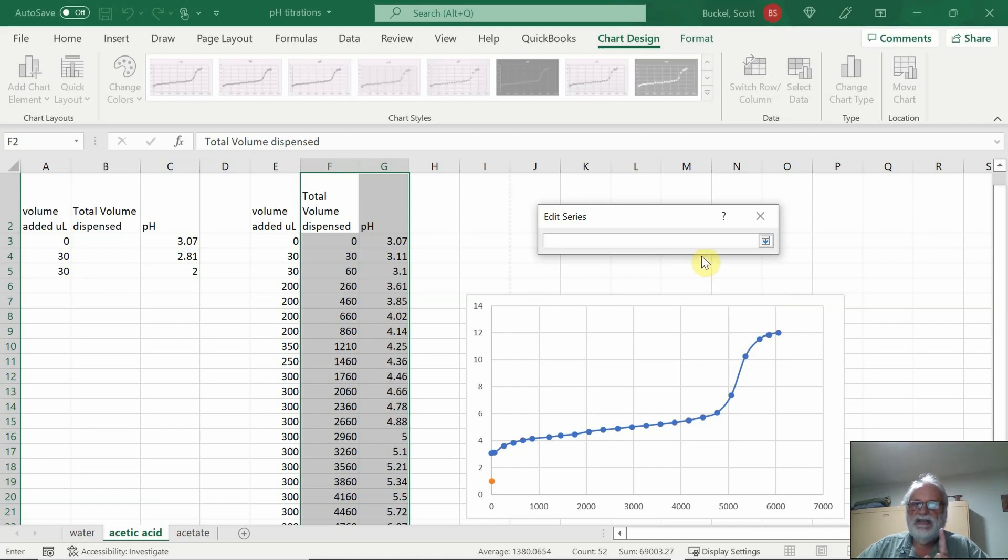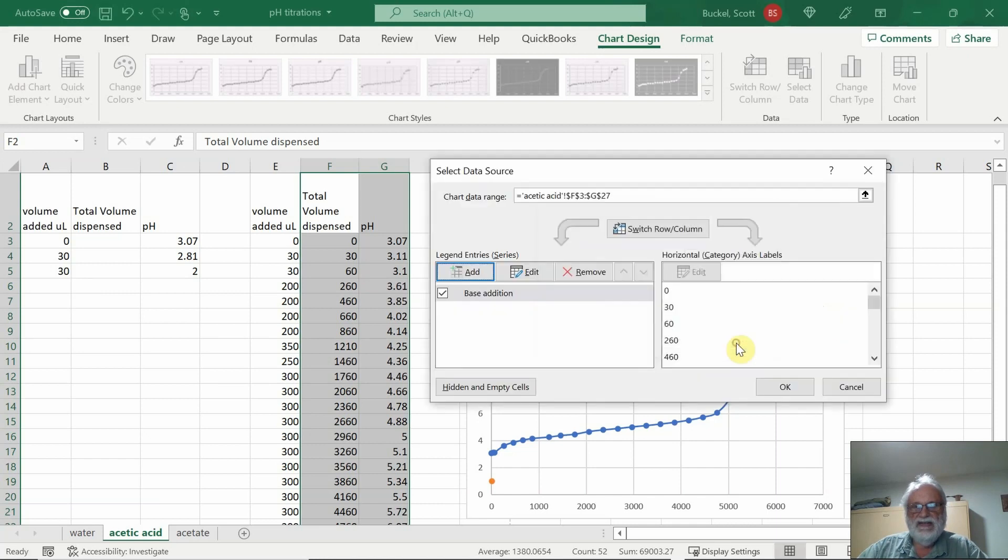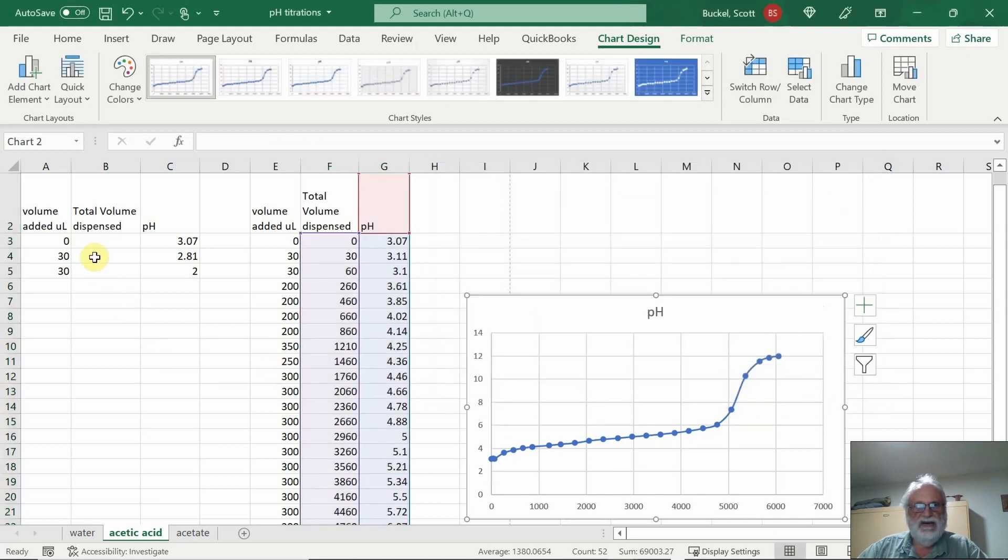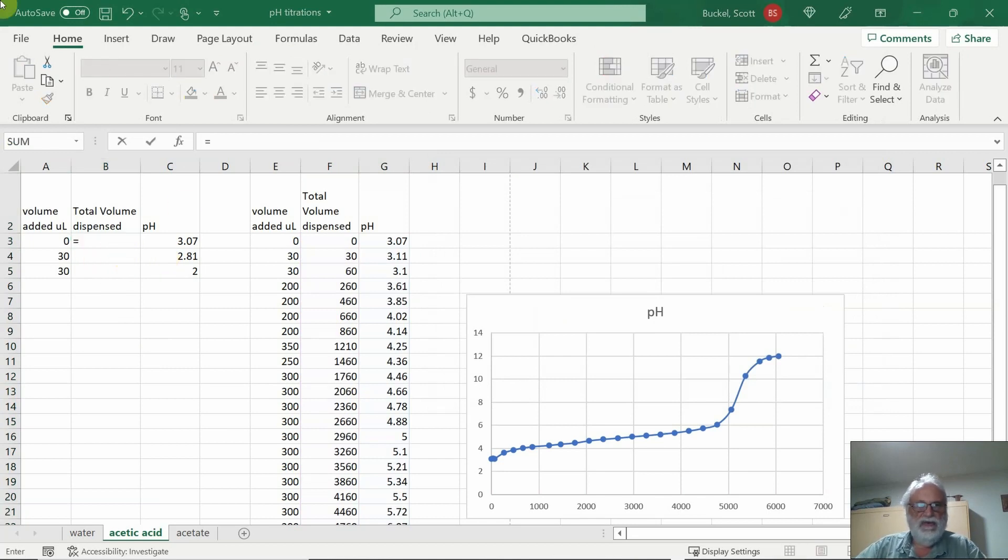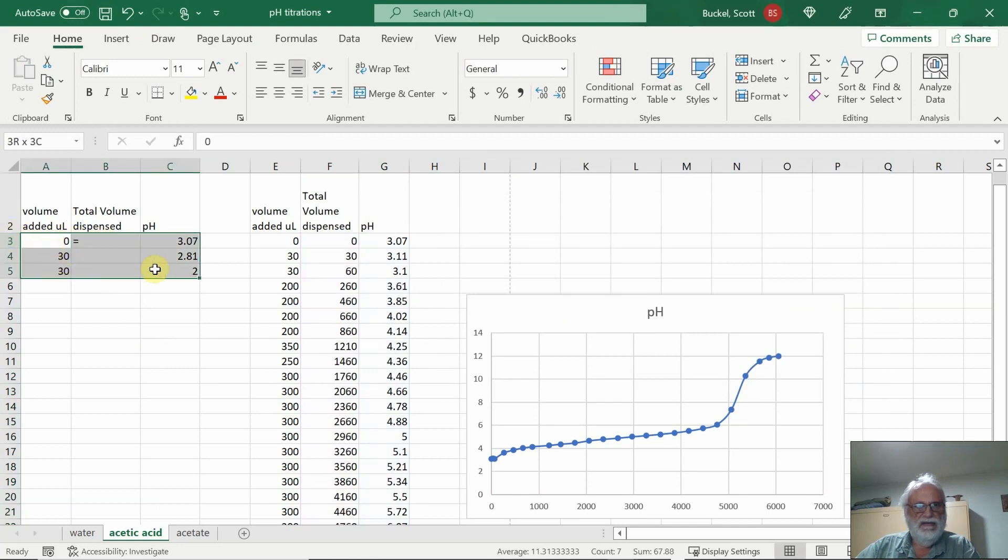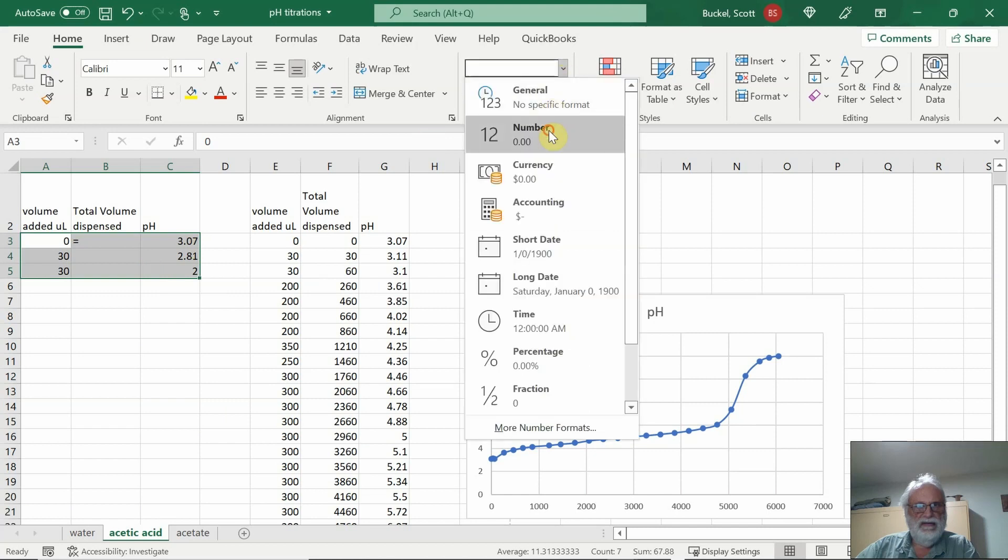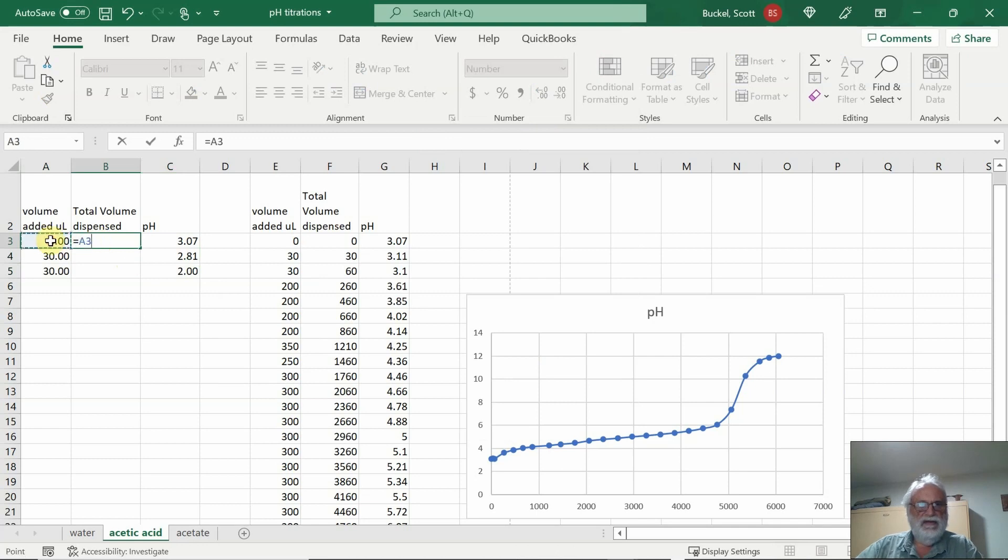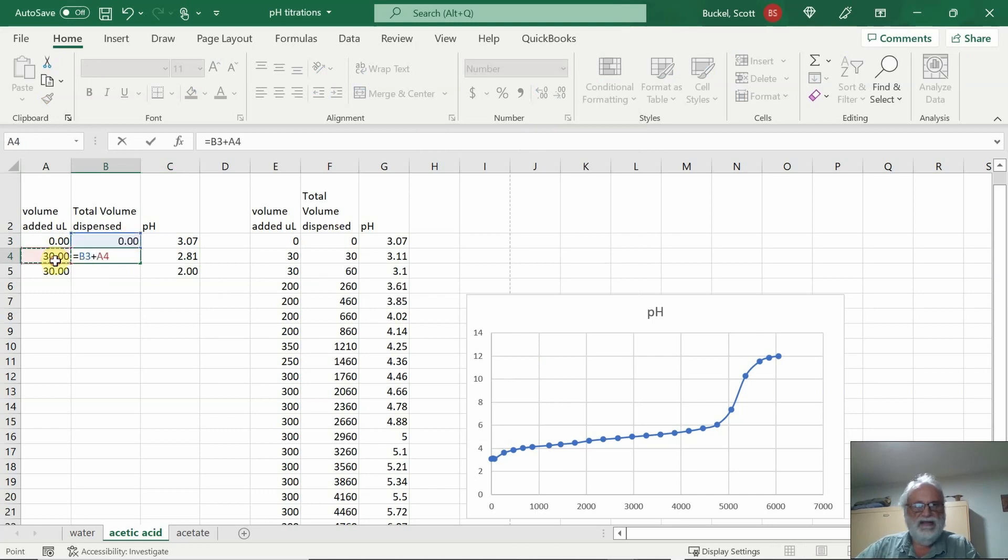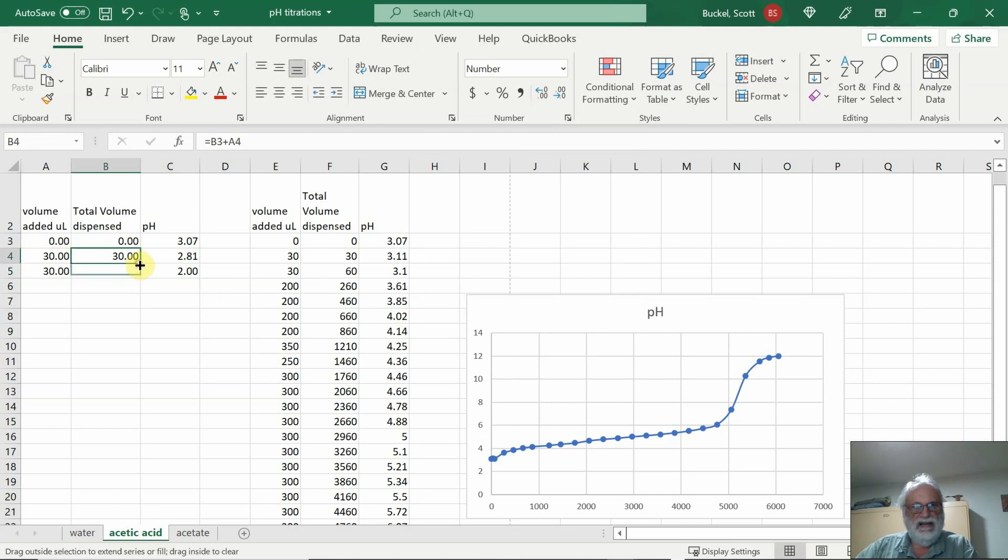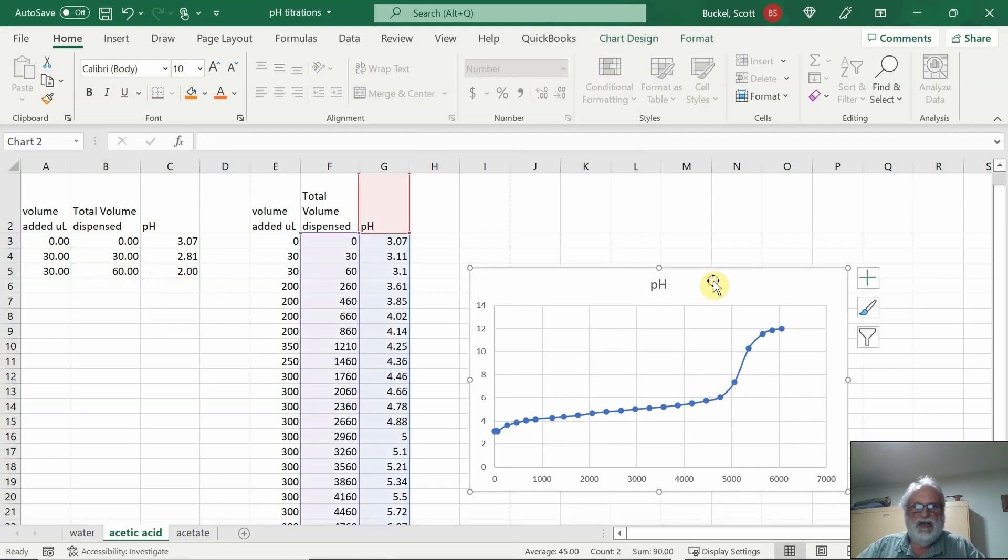Hit this. Oh, I haven't done all the stuff. So I need to back. I need to stop here. Click X, click cancel and cancel and go here. It's equal to, and this will be equal to this plus that. And this will be equal to this plus that. In this case, typing 30 and 60 would have been really easy to do, but let's go ahead and show you how to do the little math in Excel.